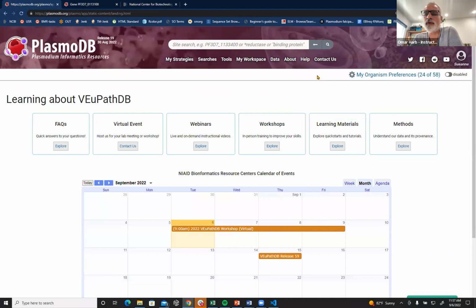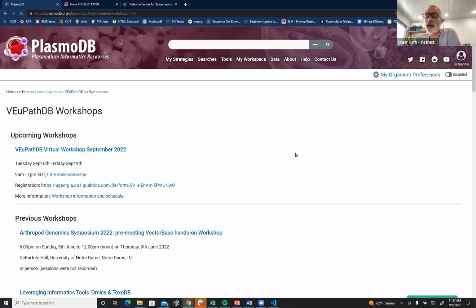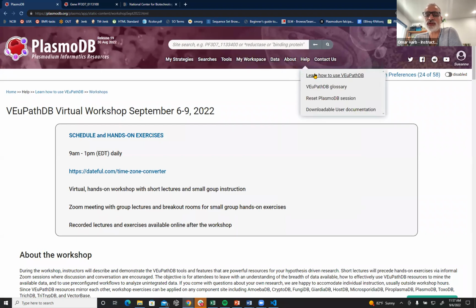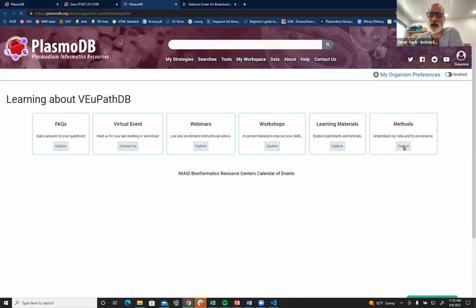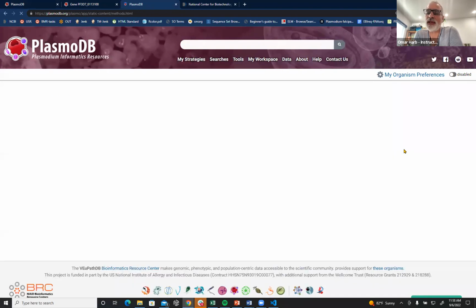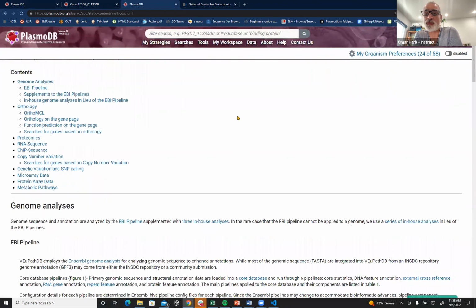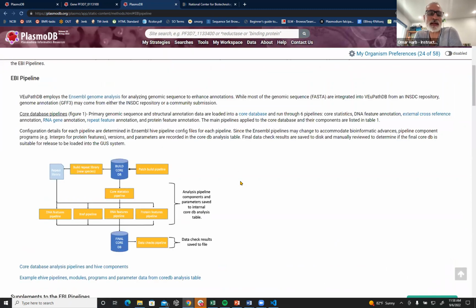I think we answered most of them online. Okay, just quickly, there were some questions about methods, like what method is used for determining signal peptides or transmembrane domains. And we do have a link to our methods section, which includes lists of algorithms that we use. Just one note is that in addition to algorithms that we run, we also run our genomes through the EBI genome pipeline.